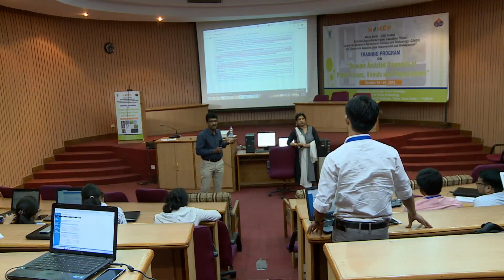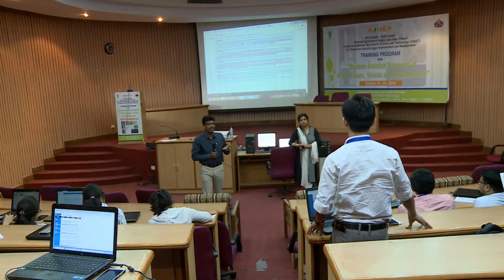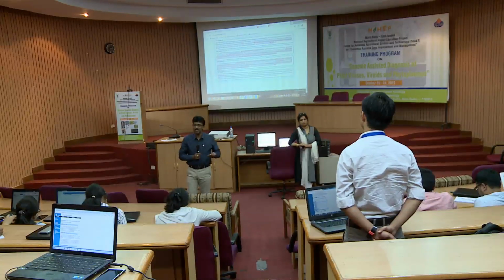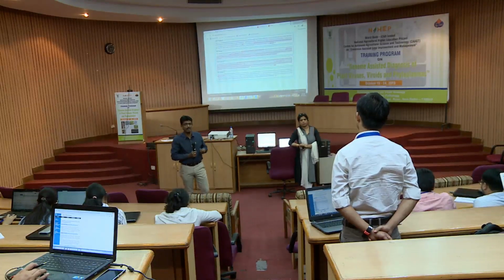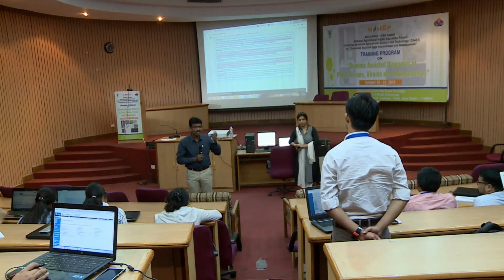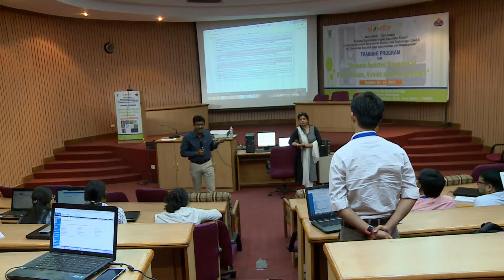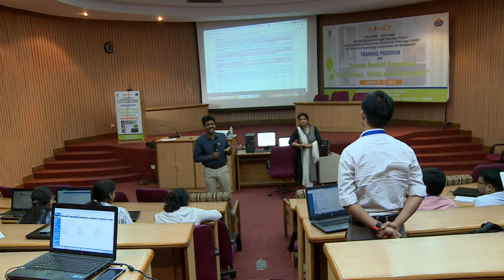The beauty of this database, again, the databases are managed by people like us only. They have to take out their time to maintain those databases. The highlight of those databases, in the case of PAMDB, because I really populated a lot of data there, is what they ask for: not your sec file or FASTA file. They ask for your chromatographic file, because the chromatographic file will not lie, it is the real file coming from the machines, right?